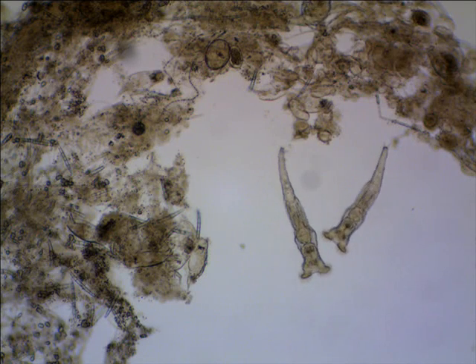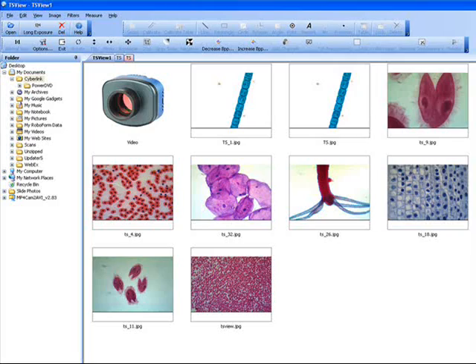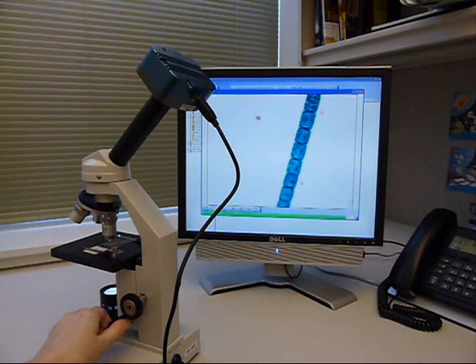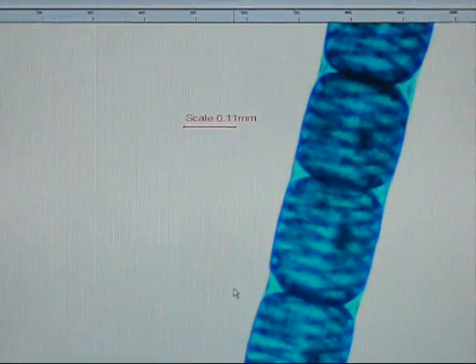These cameras allow you to capture and edit both still and video images of microscopic specimens. Each comes with special software, which includes features for capturing, editing, and annotating the images. The included calibration slide allows you to use the software to accurately measure your specimens.